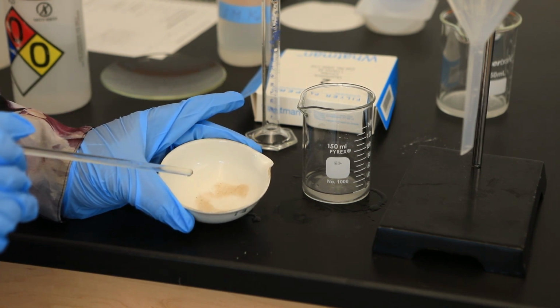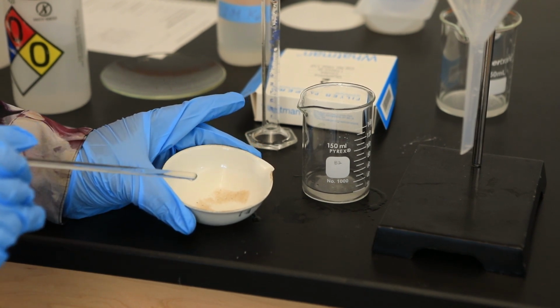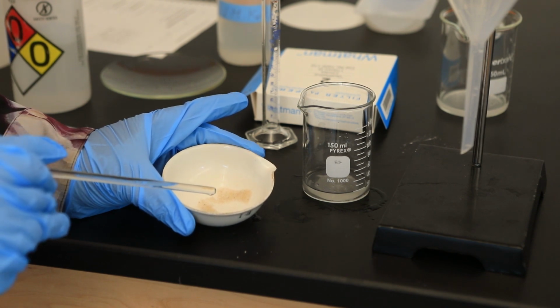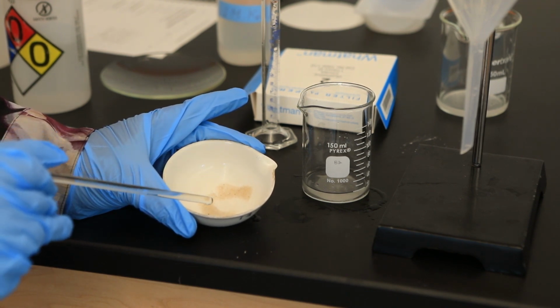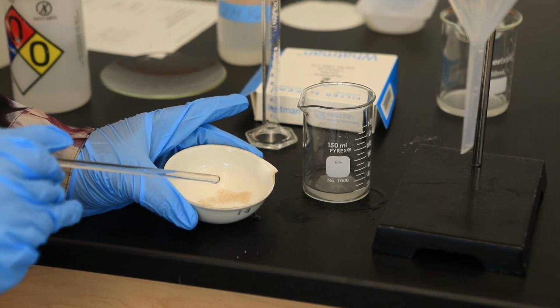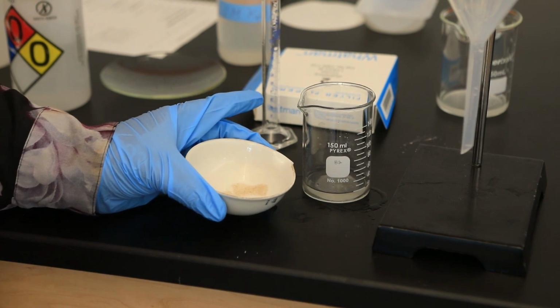But we're still not done as yet, because this sand is certainly not dry. And so I'm going to transfer that to my hot plate. I'm going to place this on top of a beaker of hot water and allow this to dry. Hopefully, it will take approximately 5 or 10 minutes.